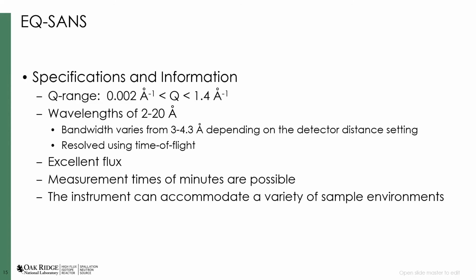That has to do with the fact that the sample area itself is enclosed in a steel enclosure for shielding purposes. But we've done a great deal of work trying to free up that space. And at the moment, we can accommodate quite a variety of sample environments. It's not nearly as diverse as the GP-SANS and the Bio-SANS sample areas, should they wish to open it up further than they do now, they've got the room to do it.